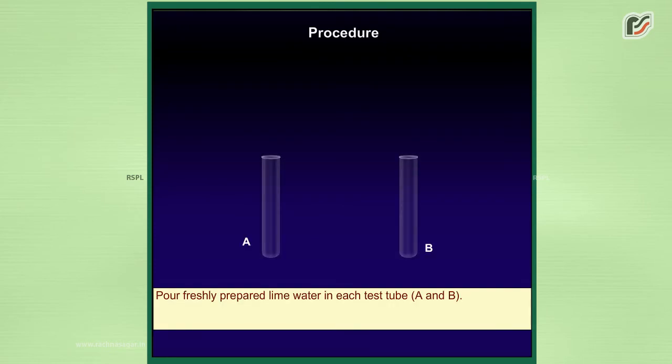Procedure: pour freshly prepared lime water in each test tube A and B.